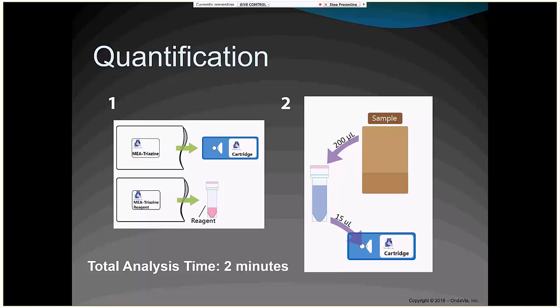And again, it's very quick because really the collection of the Raman spectrum is often a few seconds, maybe a minute or two, depending on the sample. So you can get numbers very, very quickly in a portable instrument.